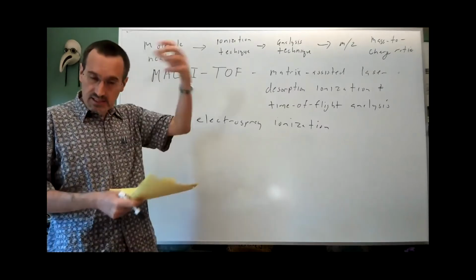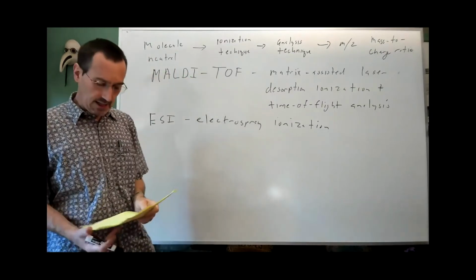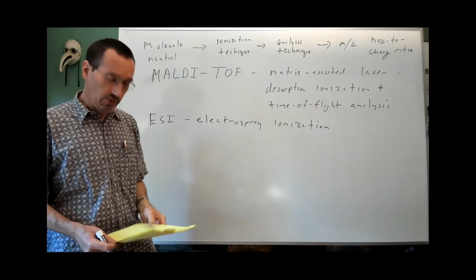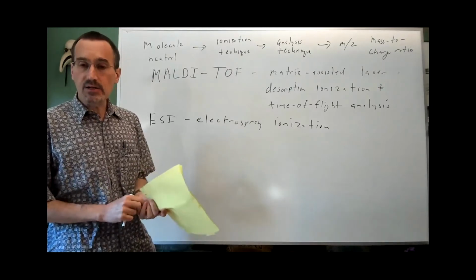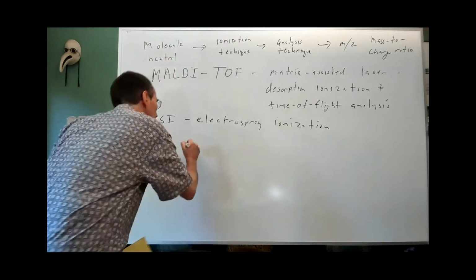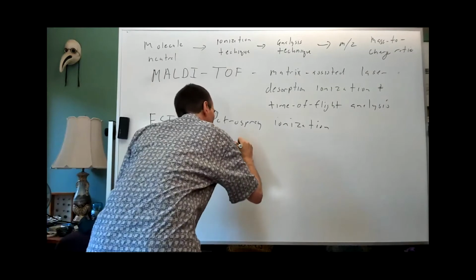And the solvent's evaporating, and the little droplets fly apart. You accelerate the molecules across a gap. And then often you will use this with a quadrupole analyzer.